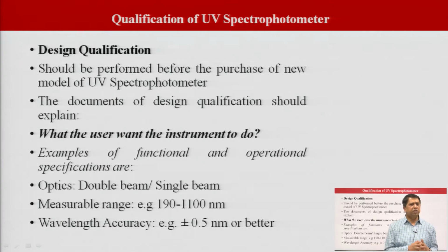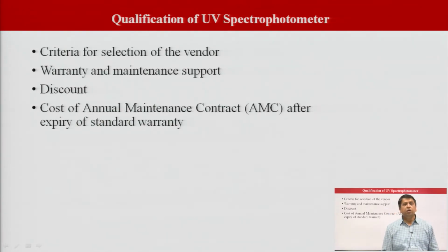For example, plus minus 0.5 nanometer or even better. The next things that should be taken into consideration are the criteria for the selection of the vendor.